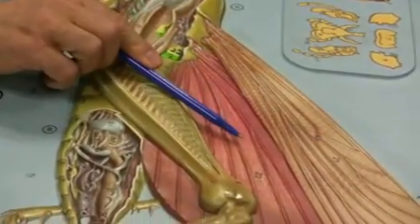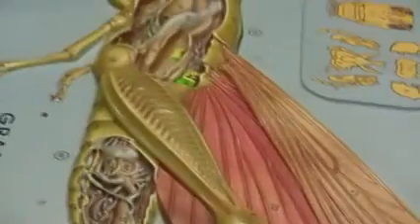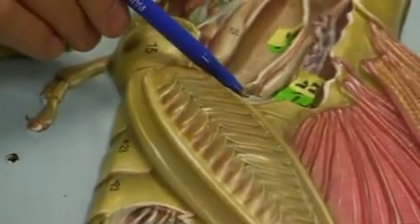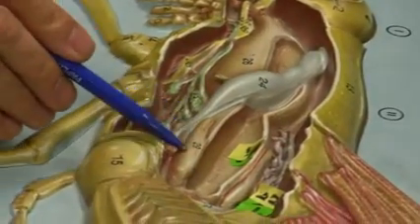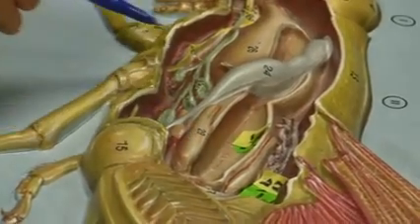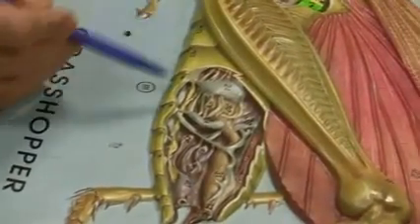Forewings, hindwings. Forewings, hindwings. This one, 21 is forewings, hindwings. Then you have tympanic membrane right here. Number 37 is your tympanic membrane. Okay. Crop, gizzard. You see that? Crop, gizzard. And then number 29 is your pyloric cecum. Okay. Then let's go over spiracles, spiracle. They open it up.